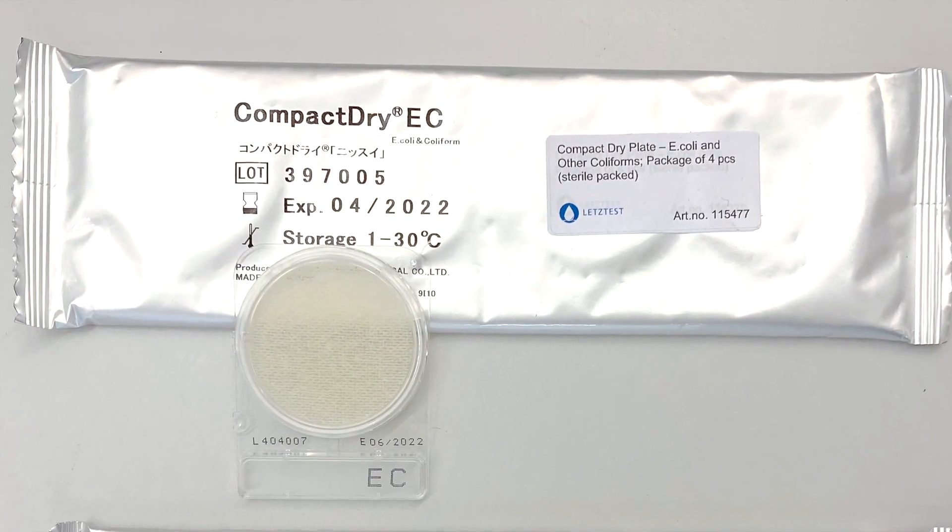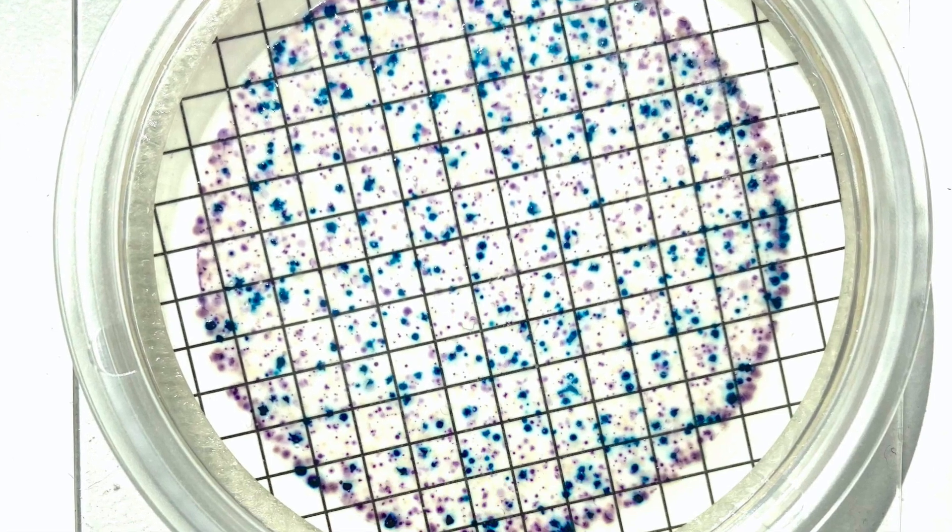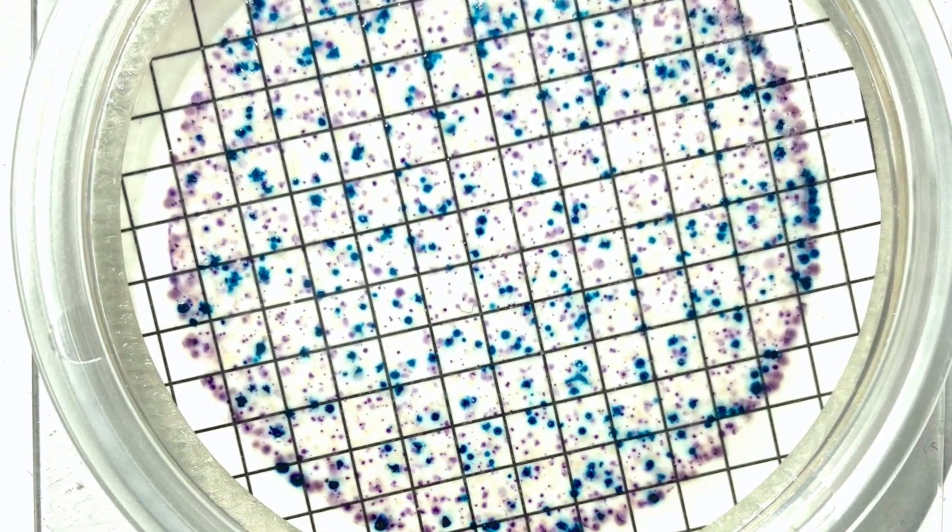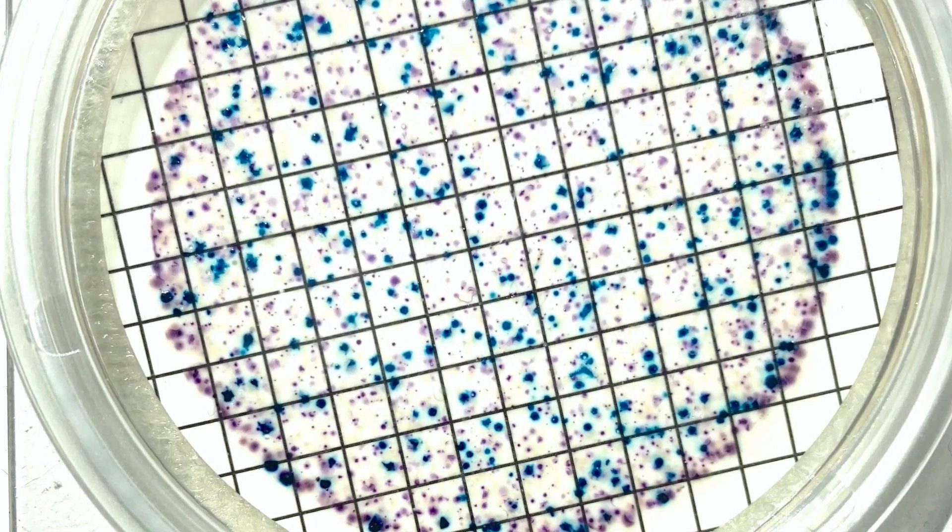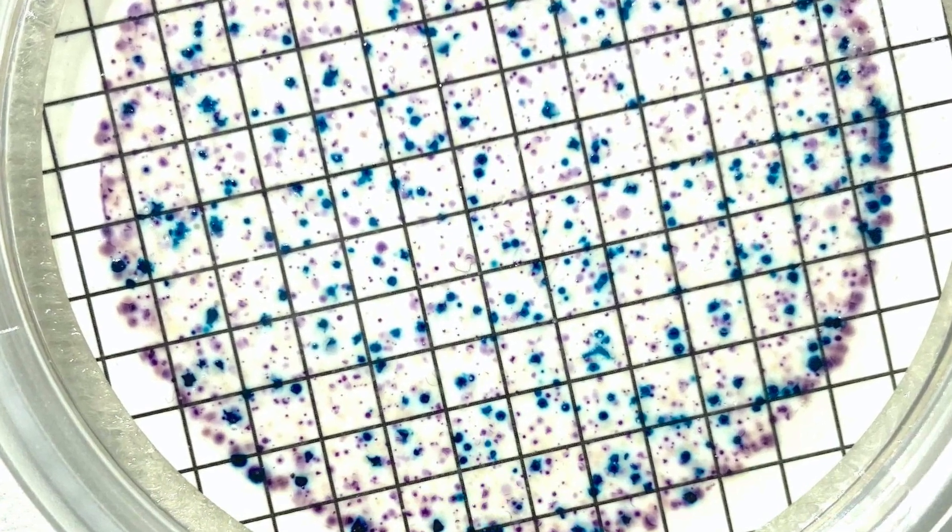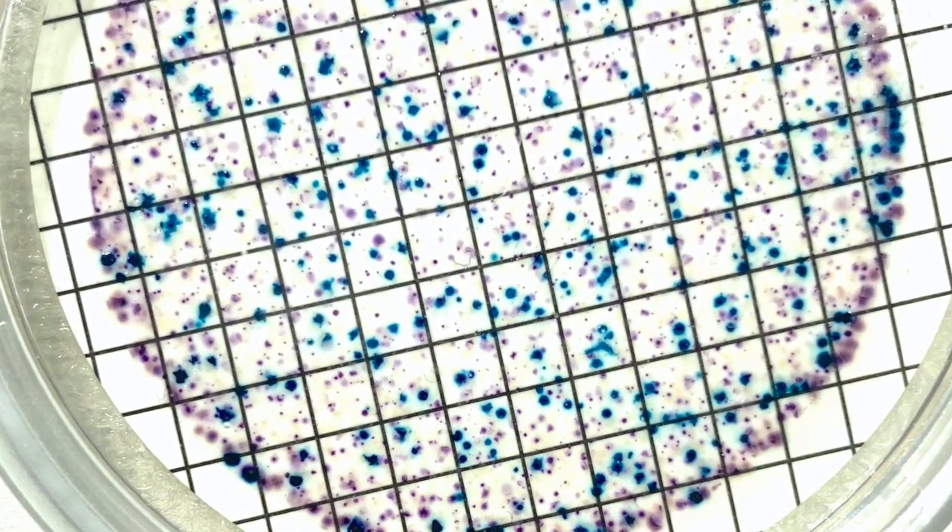If you have used the EC plate, then you will also see some pink colonies of so-called other coliform bacteria. These can be of fecal origin but can also come from the environment, especially in tropical regions. They are therefore not an accurate indicator.